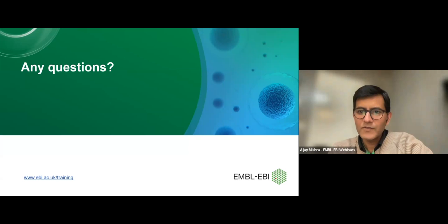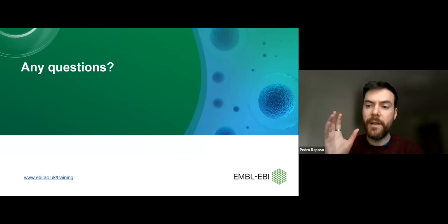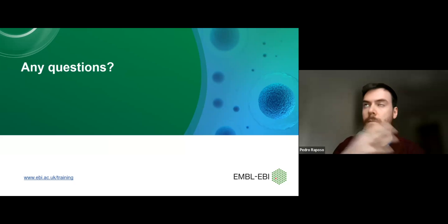In the Align tool, we can highlight the transmembrane for only one protein of the alignment. I think this question is not complete. But in the tool you can select what you want.